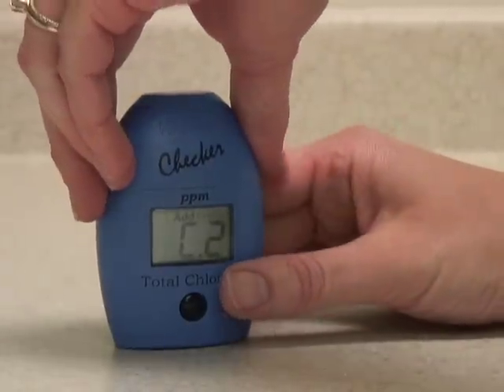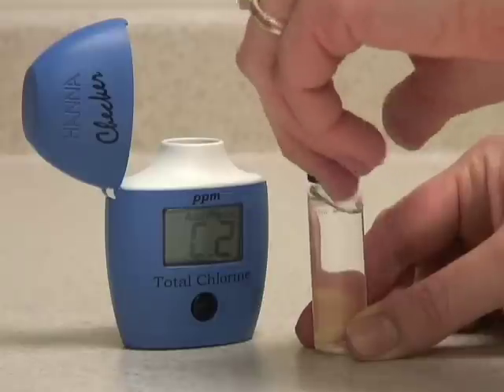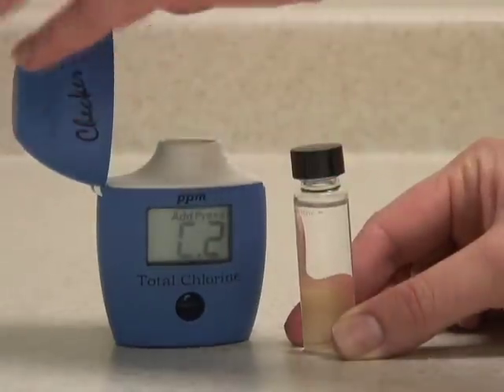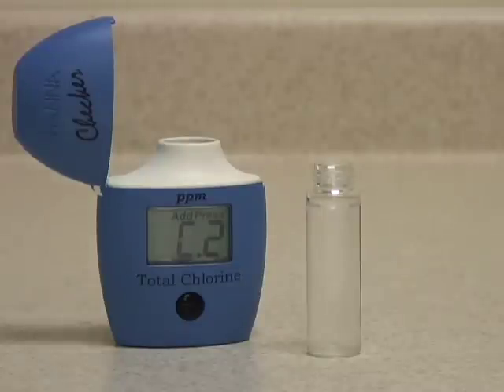The meter now displays C2. You can remove the vial. Now you want to add your reagent, trying to get as much of the reagent into the vial as possible.